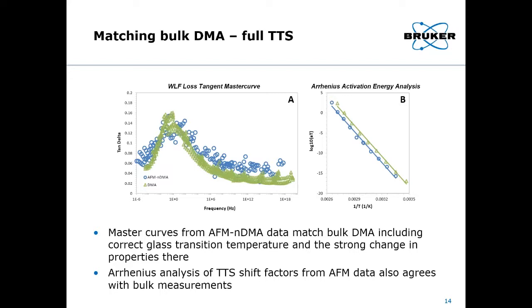For the small samples, what I'm referring to there is something like a cryosection or a thin film or just a small piece of material. For example, in the case of the PDMS, the samples were just small pieces of PDMS that were around 10 microns thick, I believe.